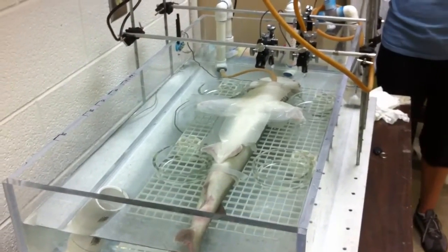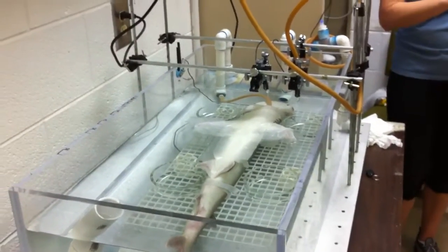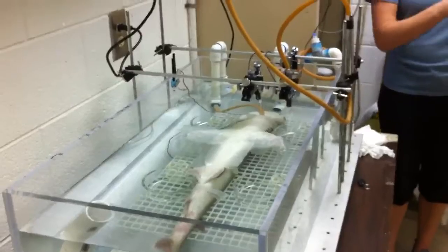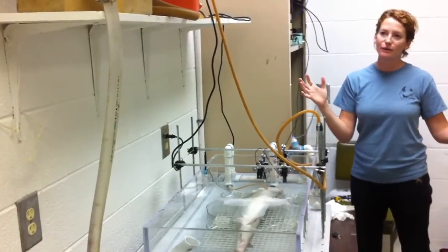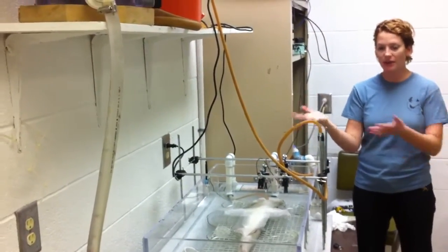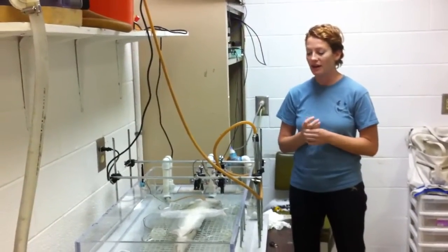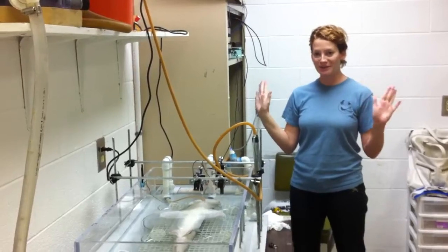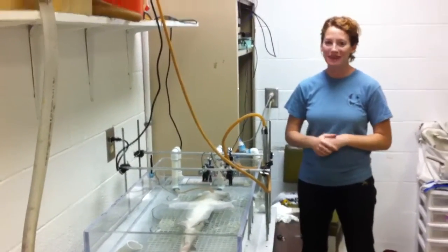This is kind of an exciting shark for me because I've done that whole initial experiment looking at the odors they're stimulated by and how sensitive they are, and then these, which are called cross-adaptation experiments, the perfume store type experiments. And that's been probably, I don't know, 40, 50 sharks that I've done this with. And they're each a day long, about this long. So it's been a lot of work. This is my very last live animal experiment for my whole dissertation. So I'm pretty pumped right now. That's so cool. Things are working, going good.